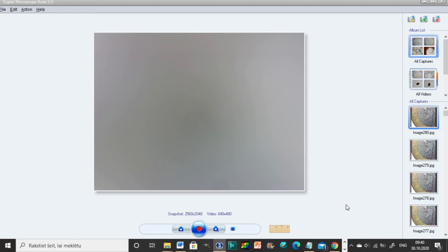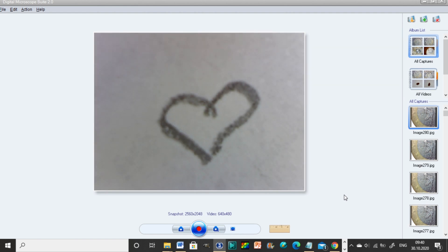The microscope does come with its own software — here you can see it. The thing is, there is no in-between magnification, as you can see with this heart I drew with pencil on a sheet of paper — whether you look at it with 10 times magnification or 150 times.